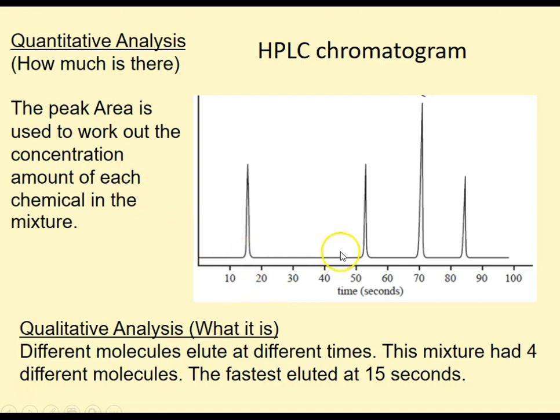So the time, that x-axis, tells you what it is, and the y-axis, the area, tells you how much.